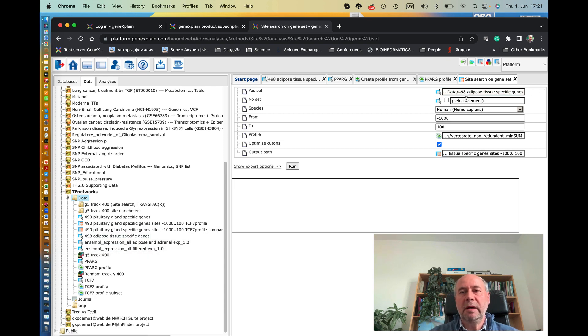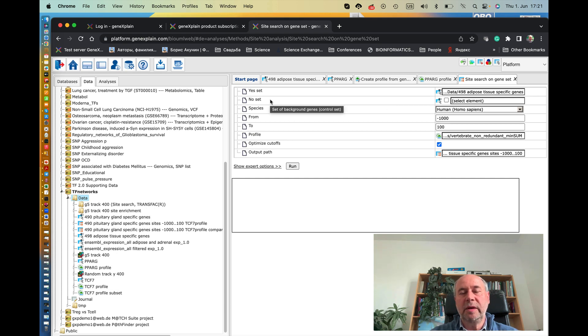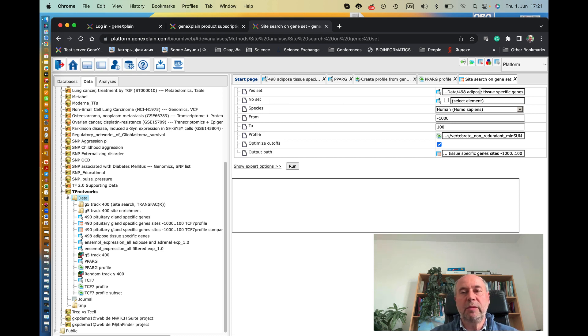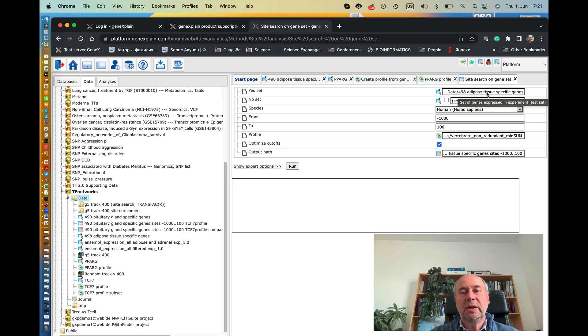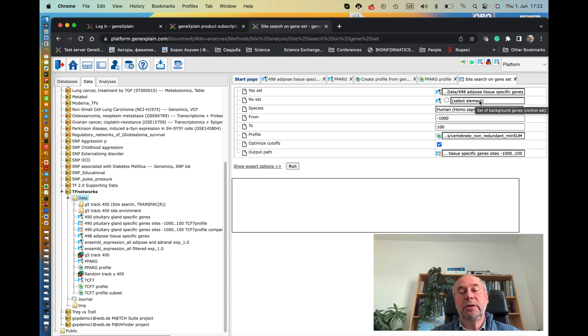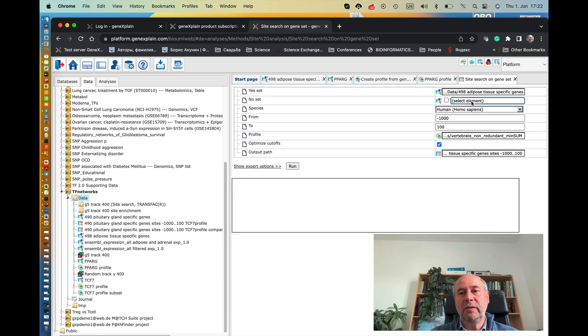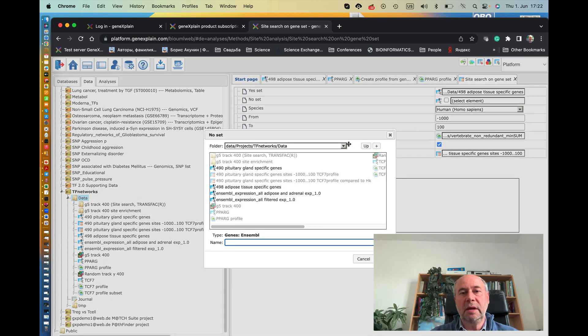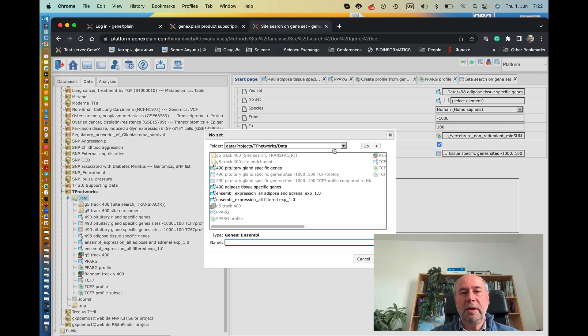And here we have to select the no set, which is a set of the ground set of genes which we want to compare if the binding sites found in the promoters of adipose tissue-specific genes should be enriched in those promoters compared to the promoters of other genes, the background genes. And as background, we can use, for instance, housekeeping genes from human genome.